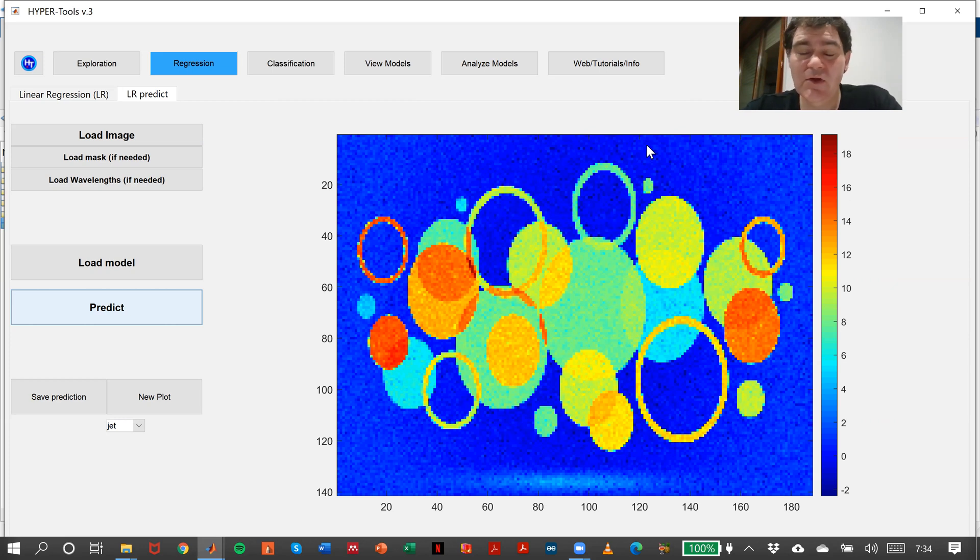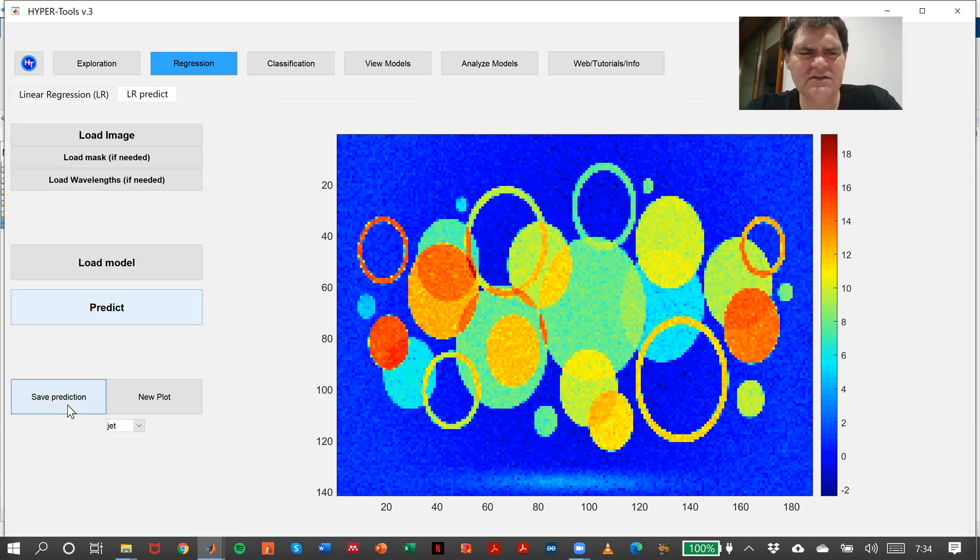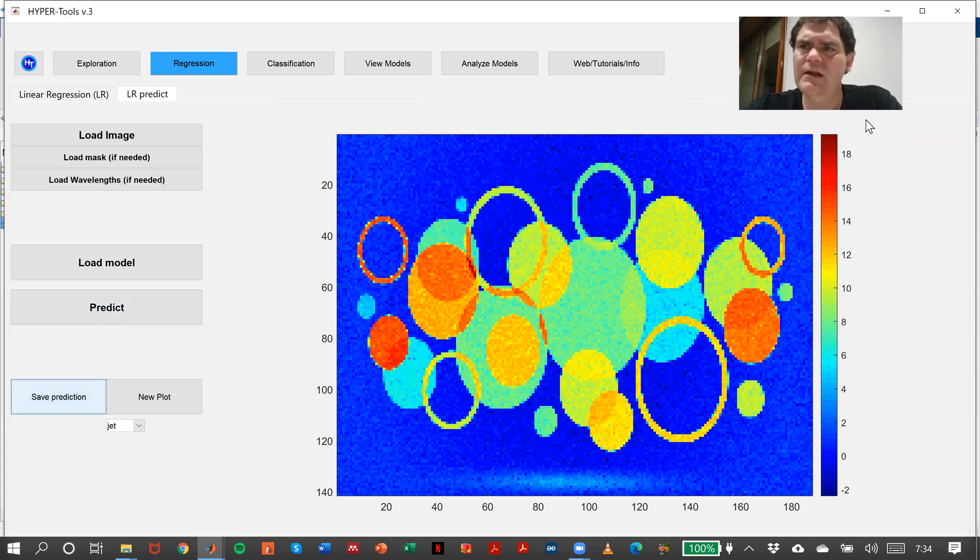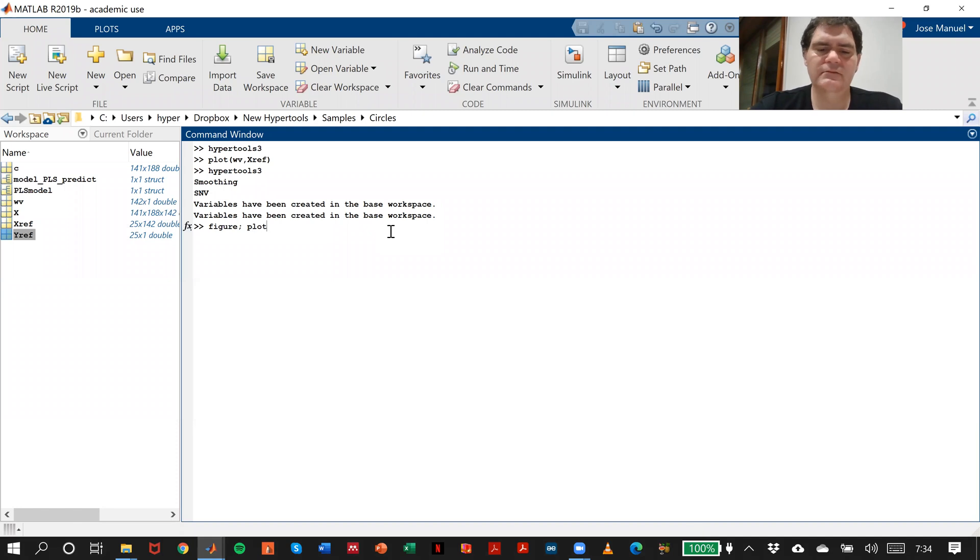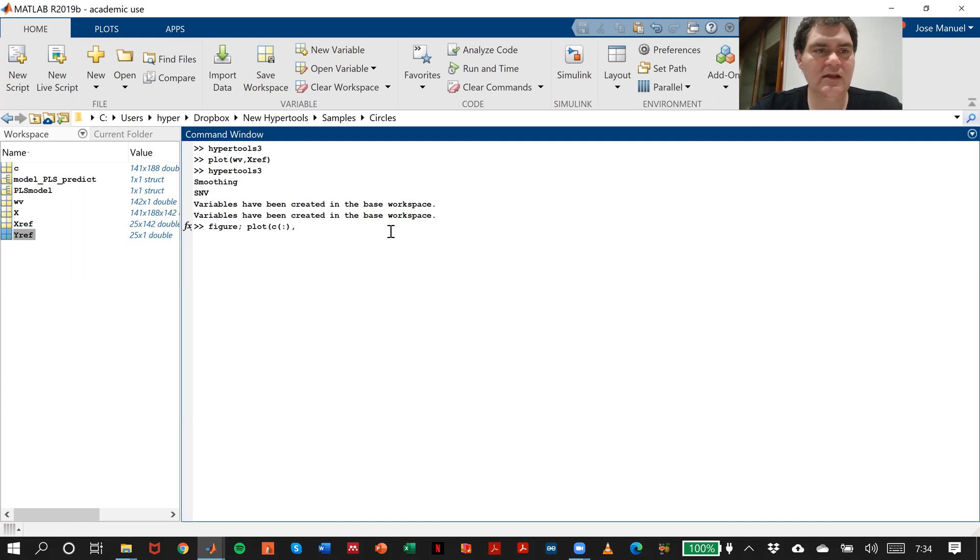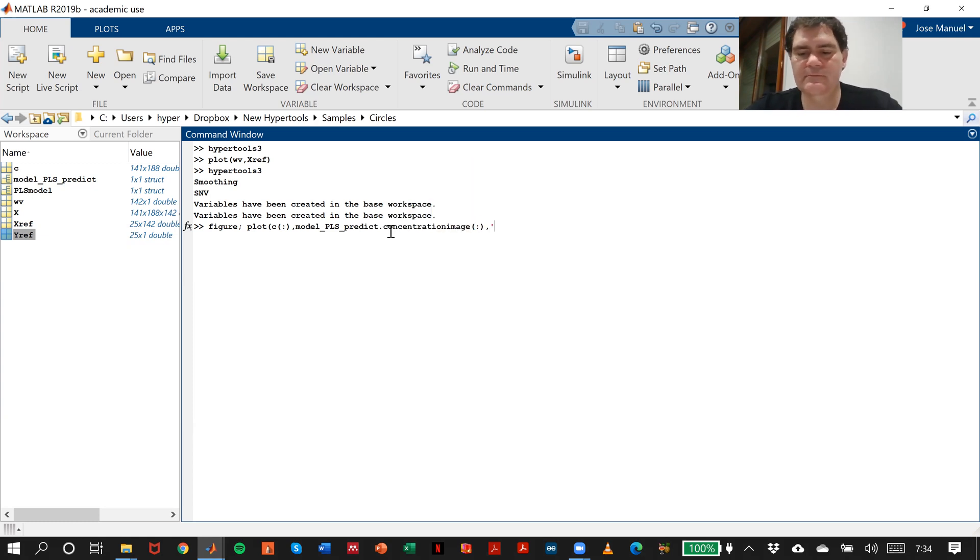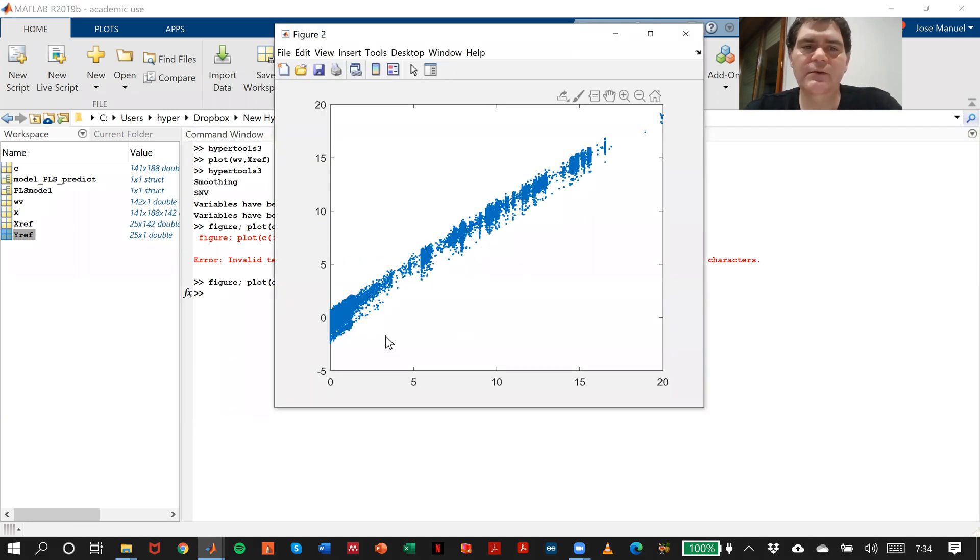Because this is a simulation, I also have real concentrations of these circles in this image. First I'll save the prediction. Now I can say these are the real concentrations, and now I can say model predict dot concentration image.